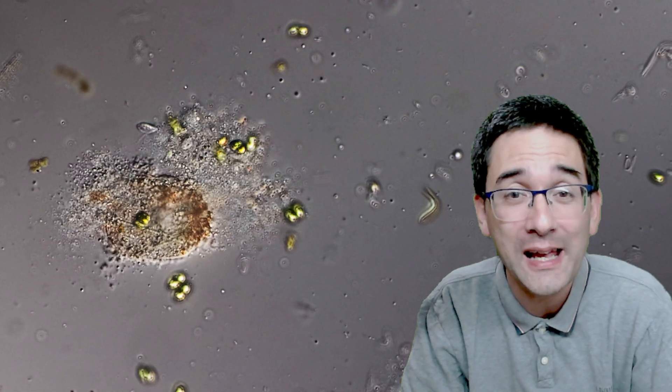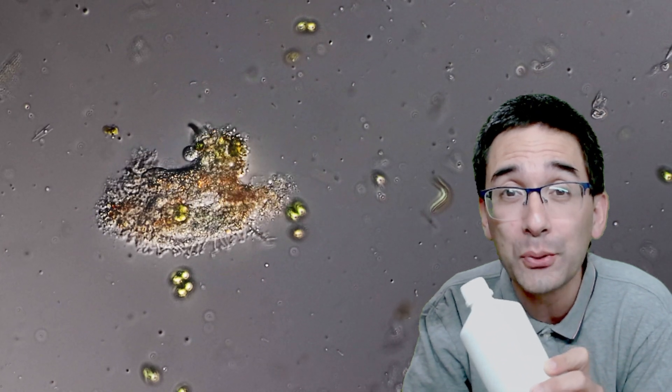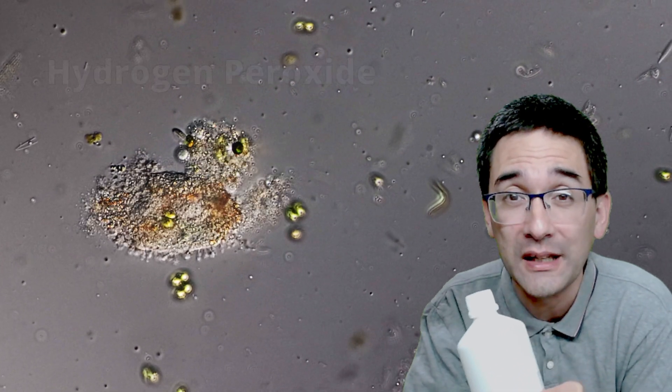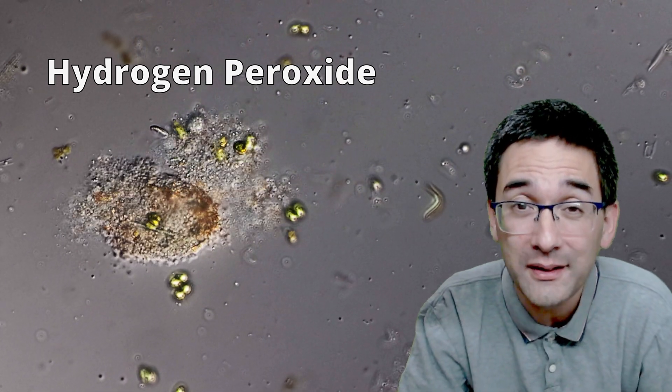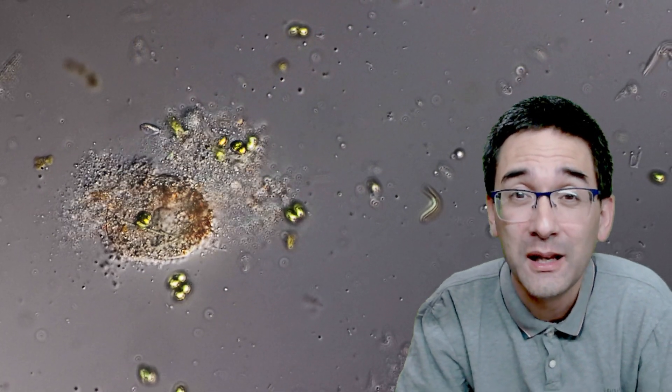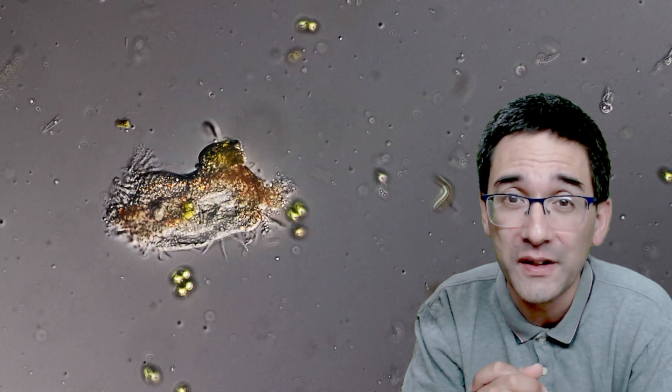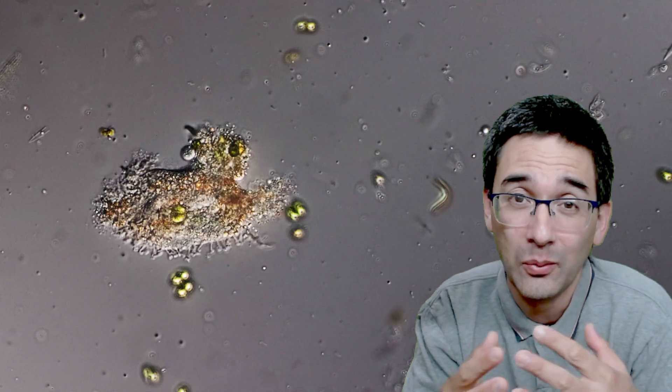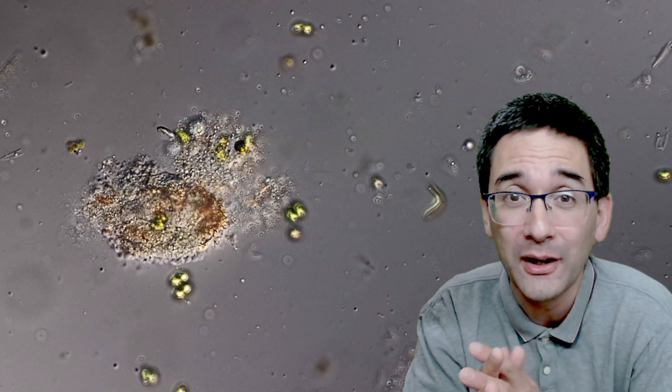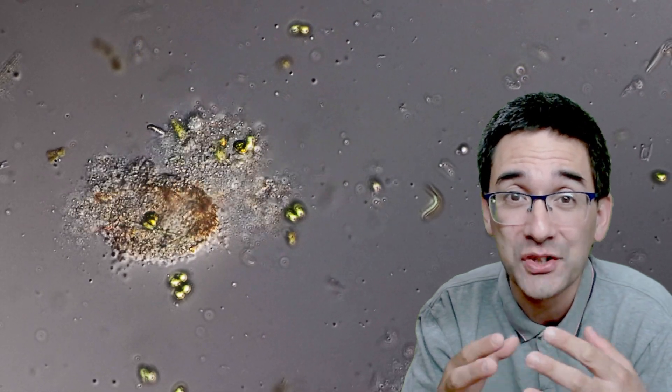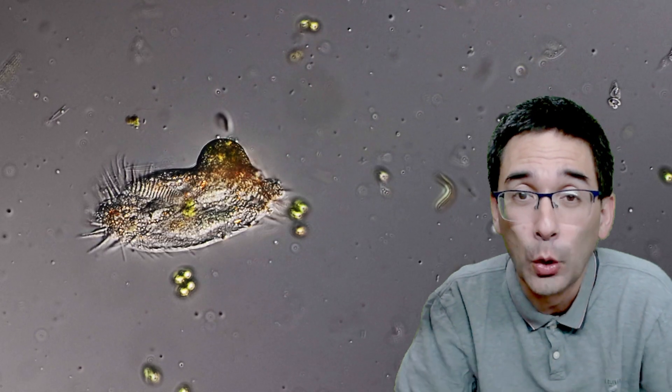It's because I added some of this disinfectant here, which is a solution of 3% hydrogen peroxide. This hydrogen peroxide is a pretty effective and quite aggressive disinfectant because it likes to oxidize many different parts of a cell. When it's done its job, the cell will die. I found that it's also able to cause the cell to lyse—lyse means to break open and spill the contents.